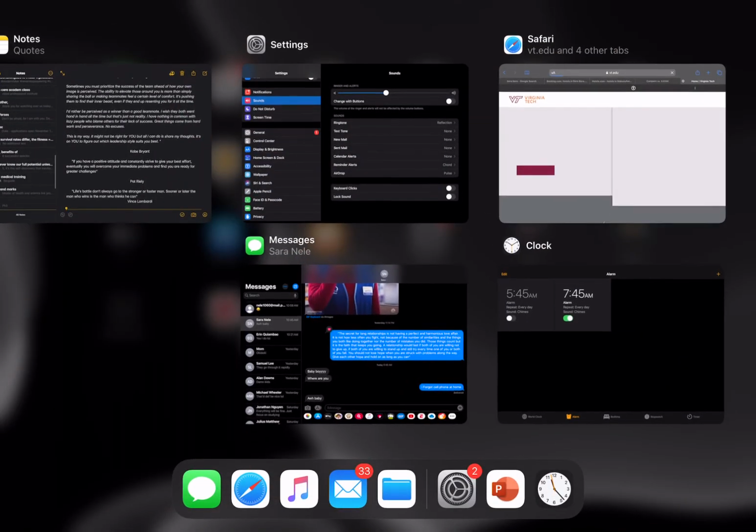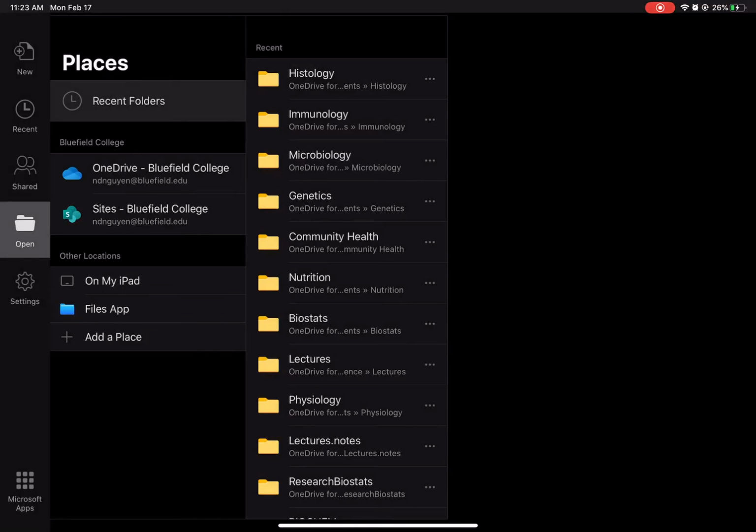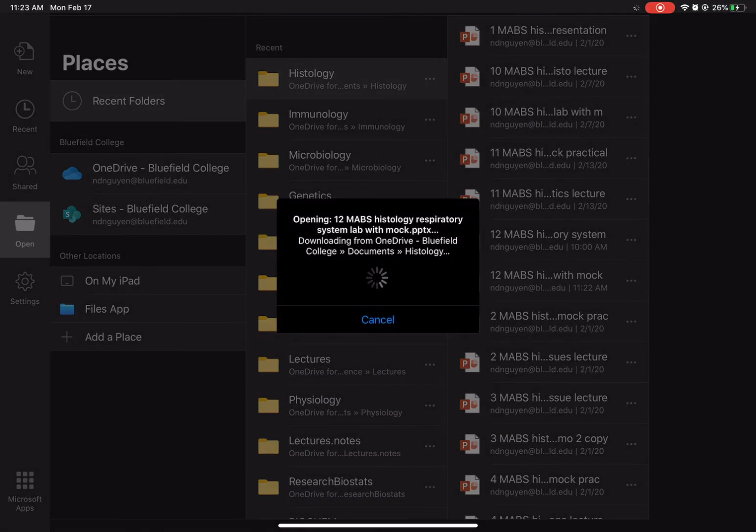I can then make out that I've got a layer here. We'll call it the lamina propria. Some books may call it a submucosa, but most sources, if it's just one layer, I don't distinguish two layers, we'll call it a lamina propria. I can see I've got glands in there. There's an arteriole right here I'm in the lumen of.